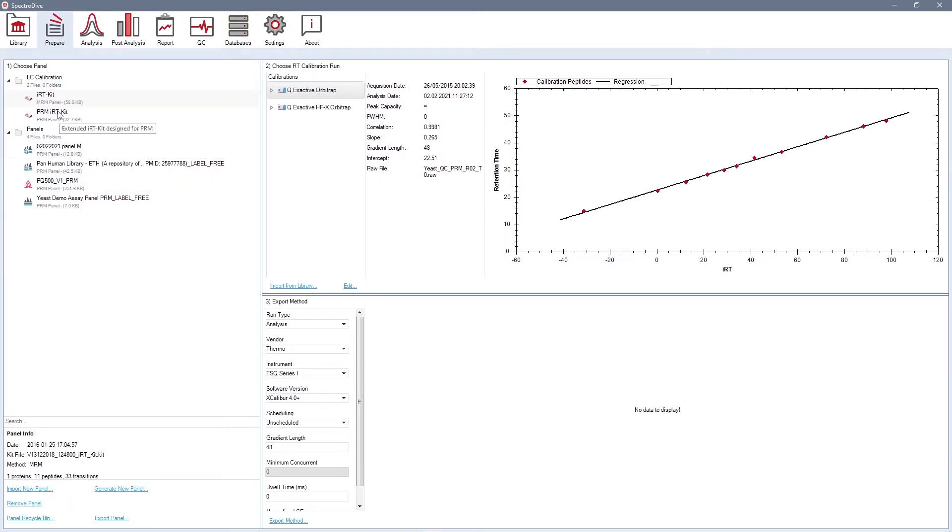In this video tutorial, I will show you how to set up a PRM analysis for samples spiked with PQ500 reference peptides. PQ500 is a Biognosys reference peptide kit designed for the absolute quantification of more than 500 proteins in human plasma or serum samples.